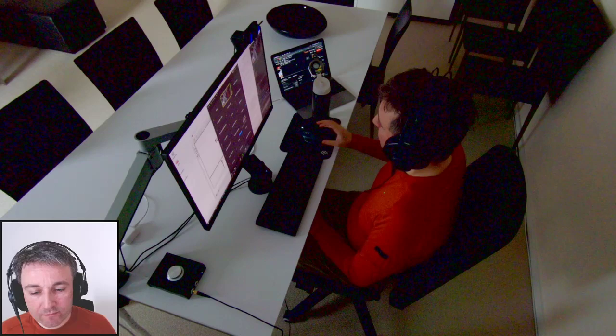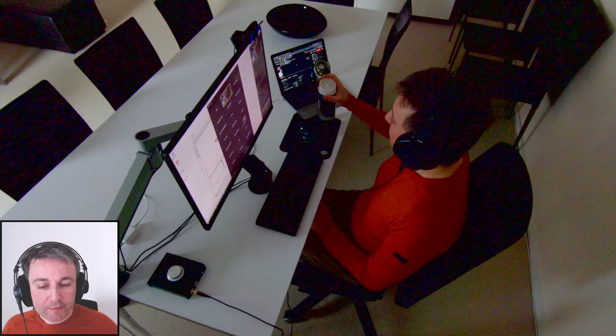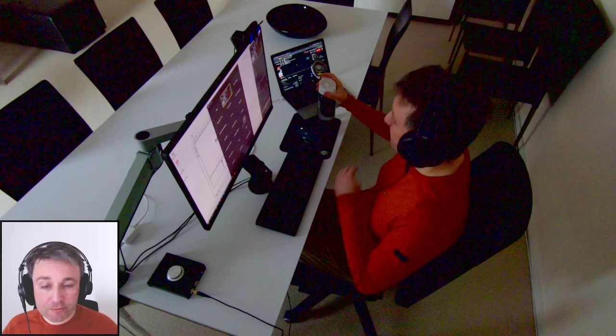So the whole point of these networks, there are many ways you can use them. You can use them to guide experiments. One way people use it is you have some gene where you don't know what it's doing, and you then try to use something like STRING to get an idea of what it might be doing and then go in and do experiments. Another way people are using it for more single gene studies is that they know some genes that are involved in a function, but based on experiments, they know that that set of genes is not sufficient to reconstitute the function.